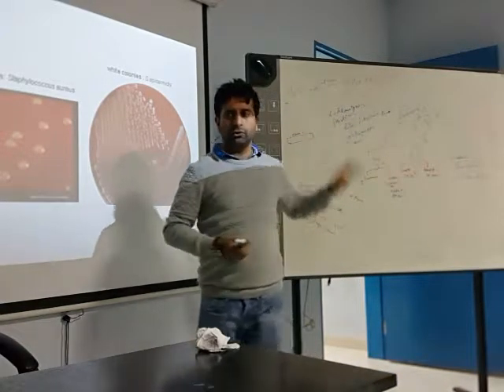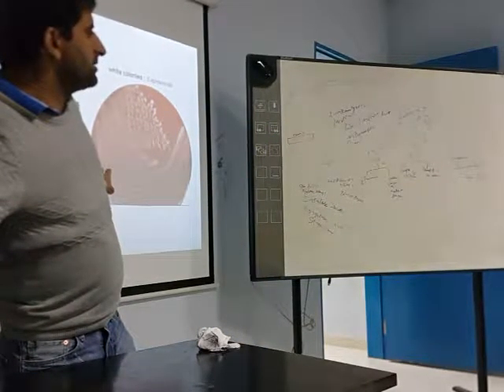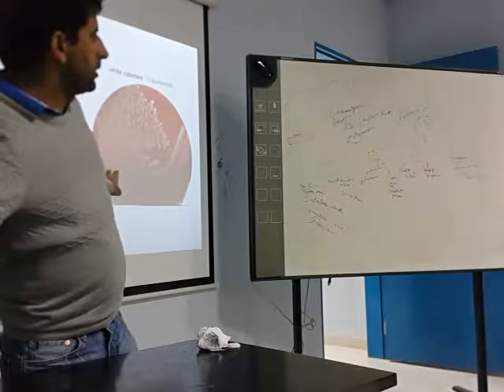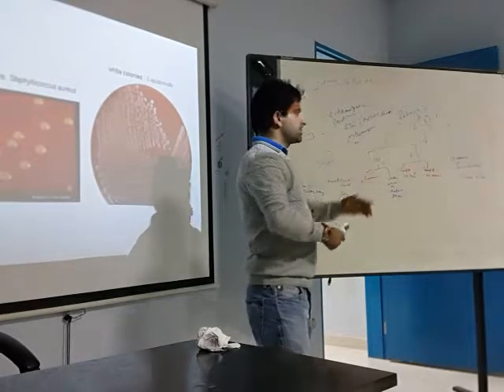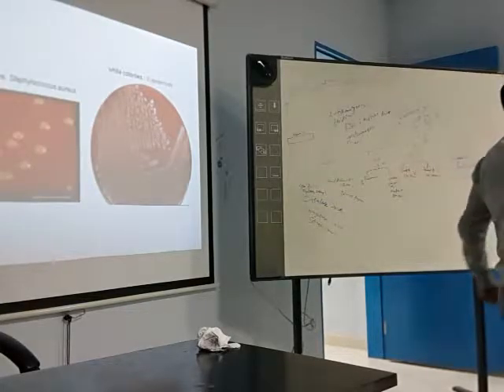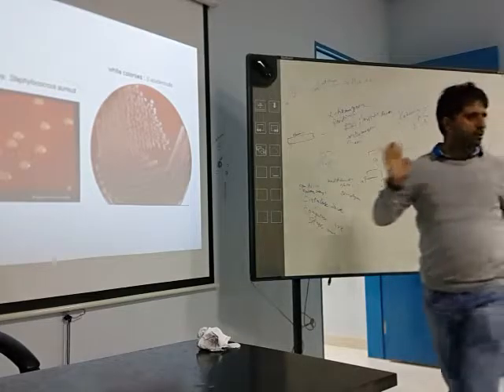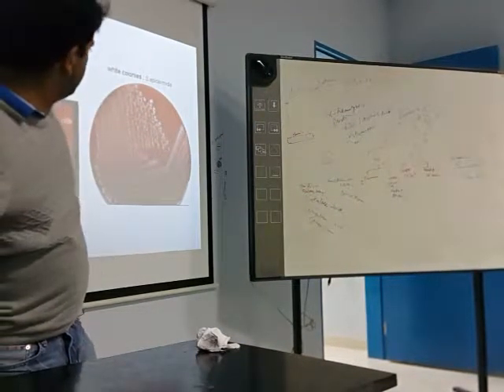Now we do one more test. Catalase negative means Streptococcus, but we are in Staphylococcus. All Staphylococci are catalase positive, and all Streptococci are catalase negative. But here we are talking about Staph.